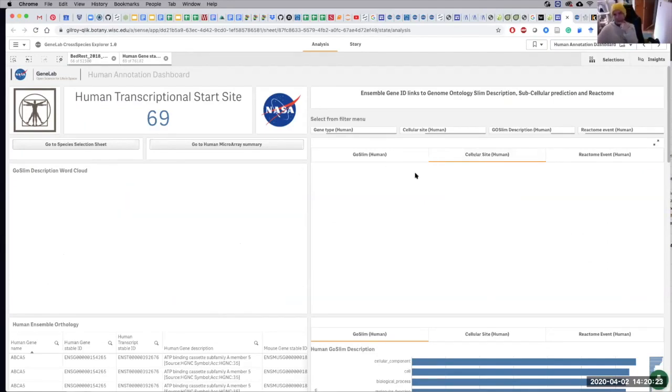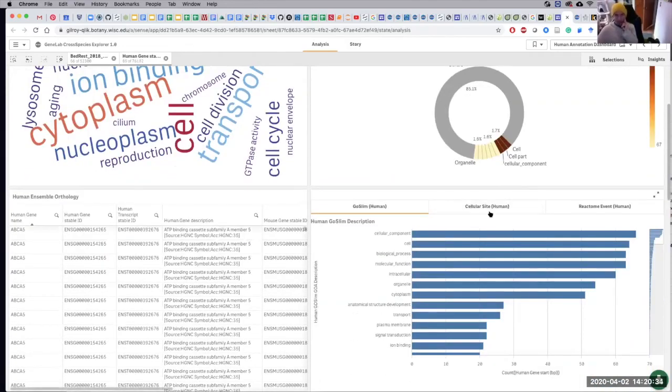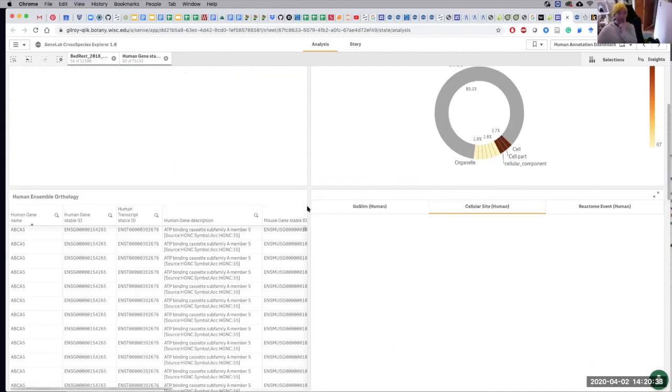You can go through and get these summaries here, in pie chart format, trying to do your standard filtering thing, but that's just a waste of space. This thing here is again to get you all these summaries of these pieces of information, but it's on the other page, so again, a waste of space.